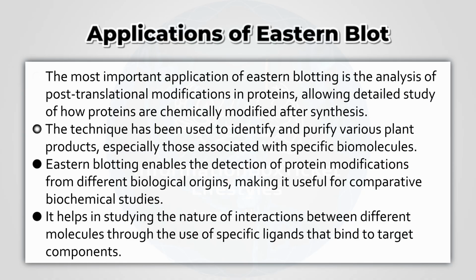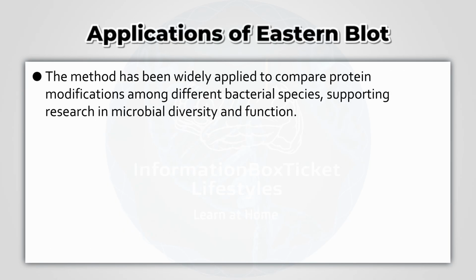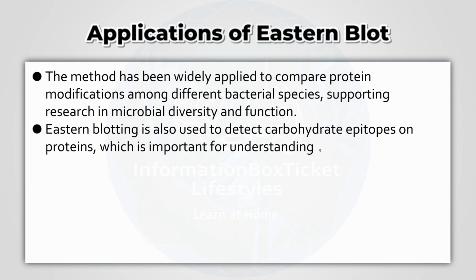target components. The method has been widely applied to compare protein modifications among different bacterial species, supporting research in microbial diversity and function. Eastern blotting is also used to detect carbohydrate epitopes on proteins, which is important for understanding glycoprotein structure and function.